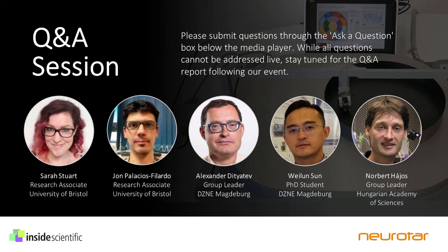For the task that I showed in my talk, where the mice had to go to a specific target location and wait in order to get the reward, it took them about 2 weeks of training to do that in the mobile home cage. Whereas in a freely moving animal, they'd probably be able to do that in just a few sessions, I would expect. But I think that's typical with any head-fixed setup, that it takes longer for them to learn than you'd expect in a freely moving animal.